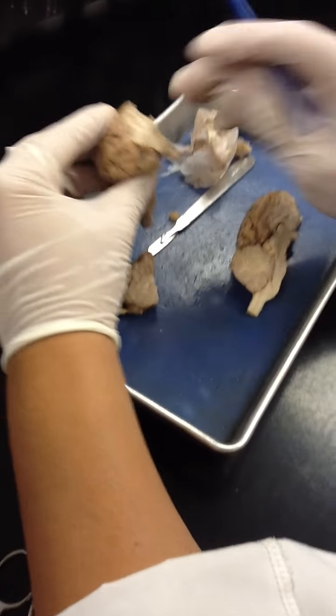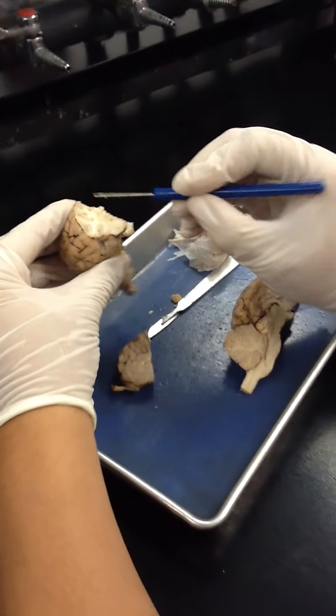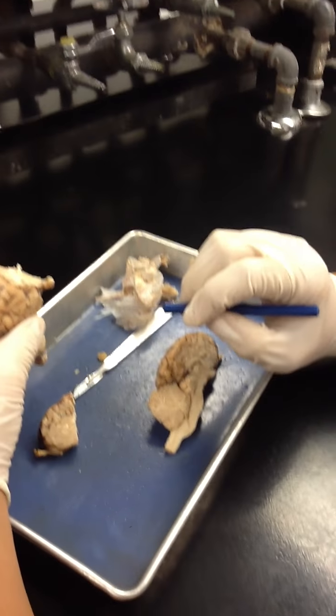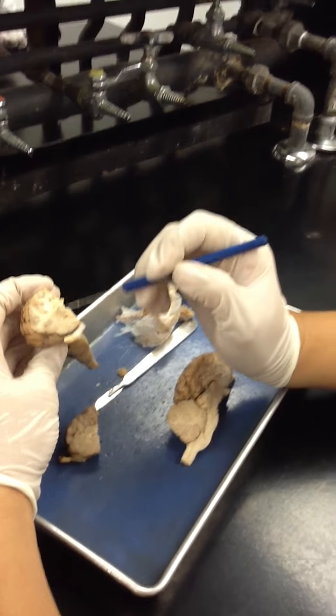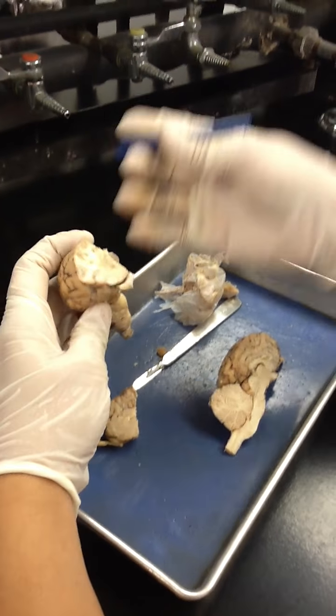Okay, and then we don't call this arbor vitae. That is only in the cerebellum. And then here is this white matter, mostly white matter. Do you see the gray matter wrapping around it? So the more bumps and grooves we have, the more gray matter we have. Do you see that? Because it goes up and over more. So that's why the more bumps and grooves, the more neurons you have, the better processing power you have.